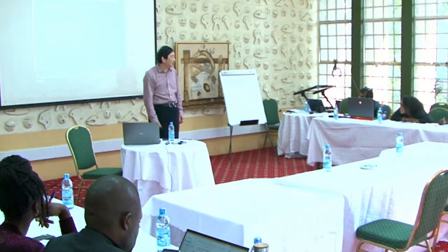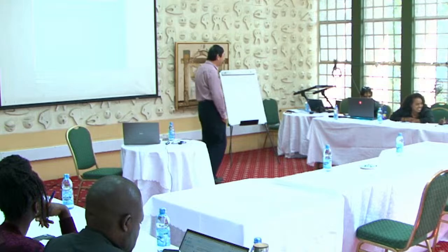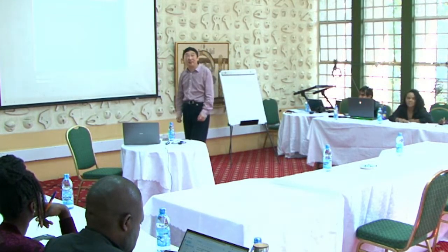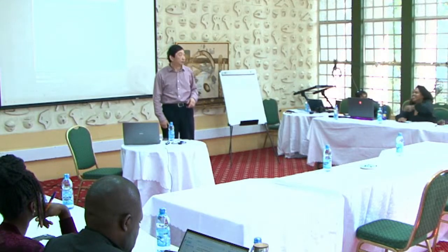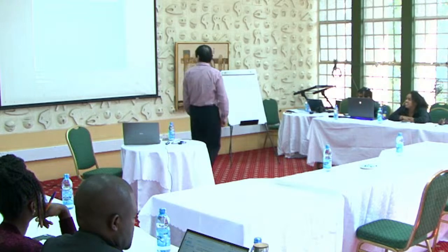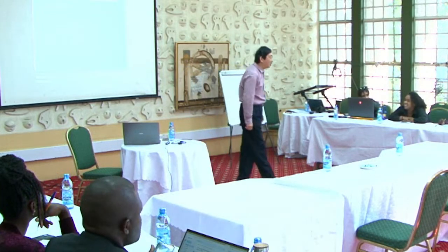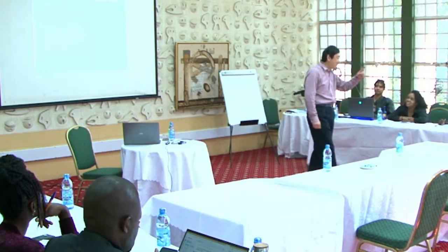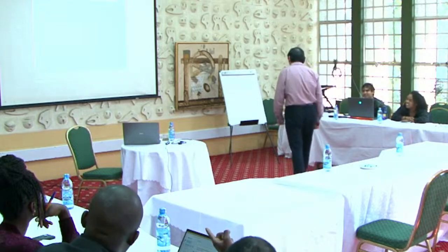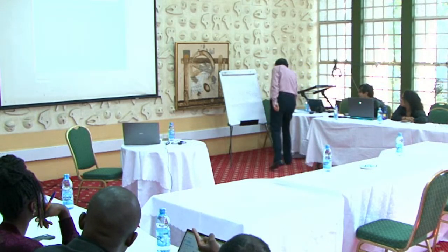Okay, this one. Can we make it bigger? There's a 91, so there's an aromatic ring. At least from this class you remember 91. So with 91 you can immediately write a structure, right?